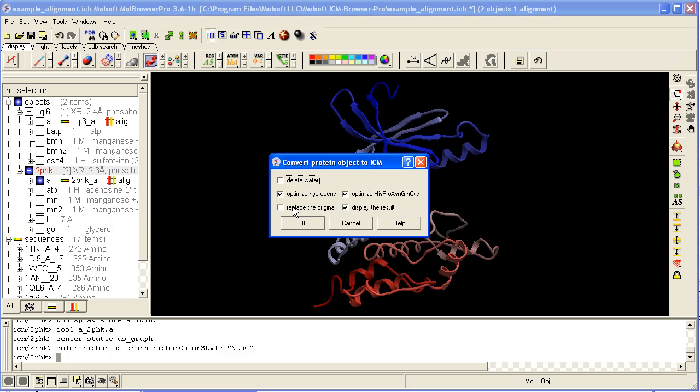Then there's an option to replace the original, just overwrite the X-ray file, or display the result.